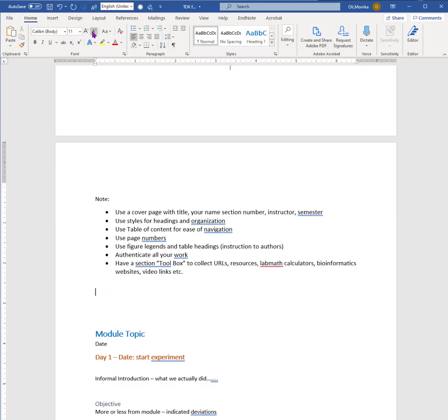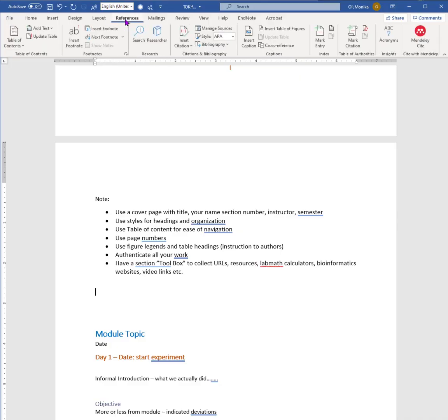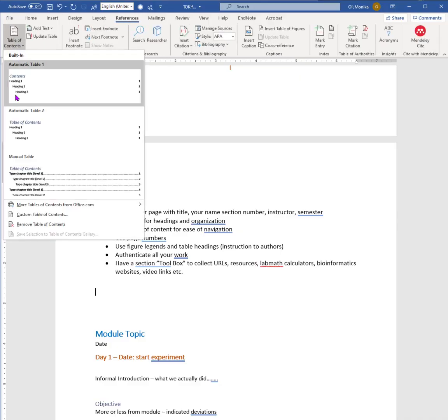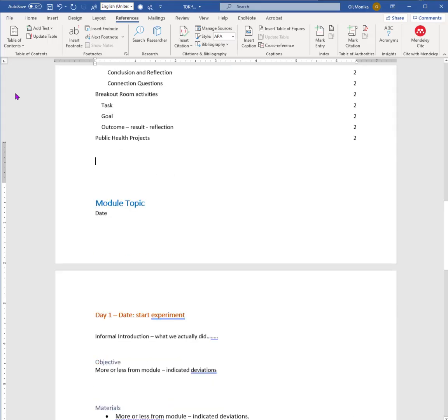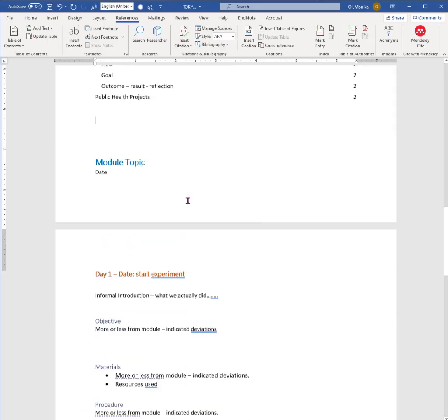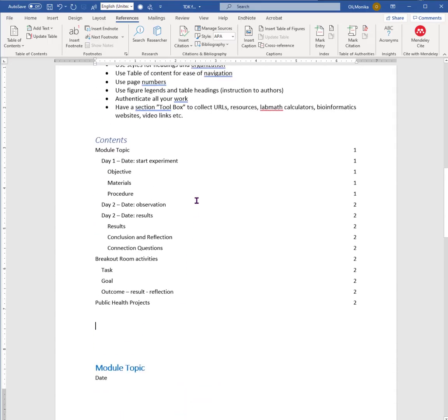To add your table of contents you go to References, you go to Table of Contents, and here we go, here's your table of contents.